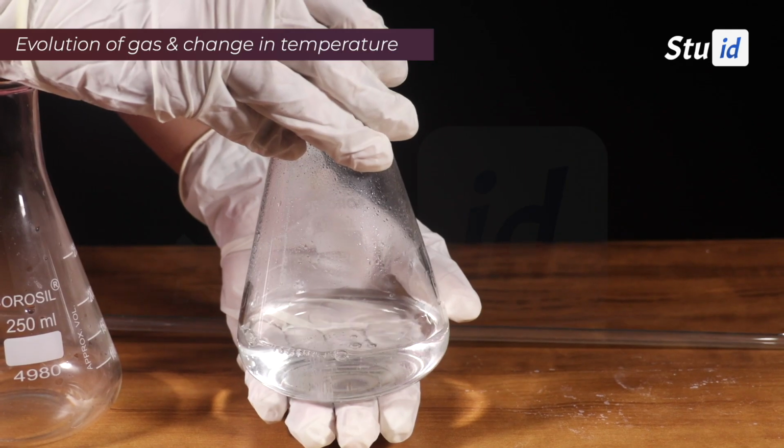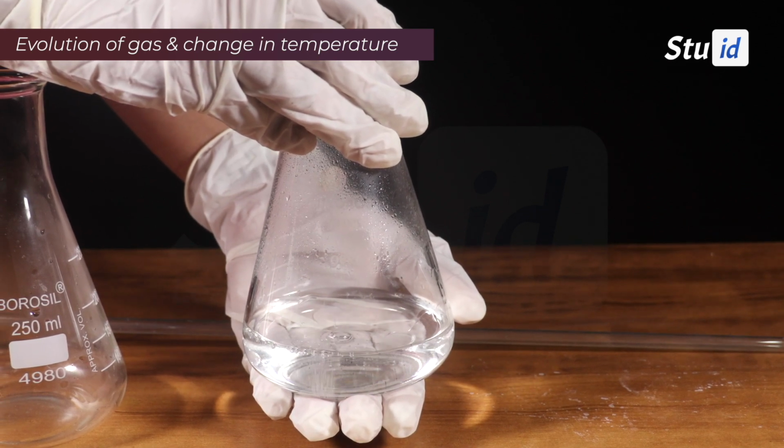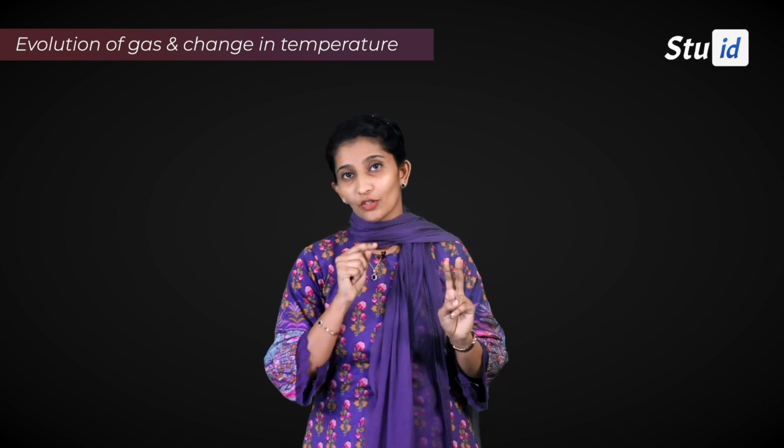And when we hold this conical flask at the bottom, we can feel it is hot. So, by this, we can notice two things are happening, which is evolution of hydrogen gas as well as change in temperature. So, this too has happened because of the chemical reaction which is undergone in the conical flask. I hope this is clear for you guys.